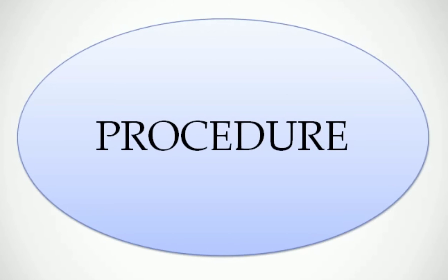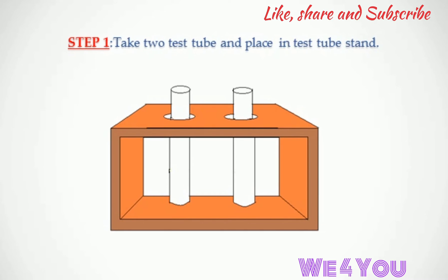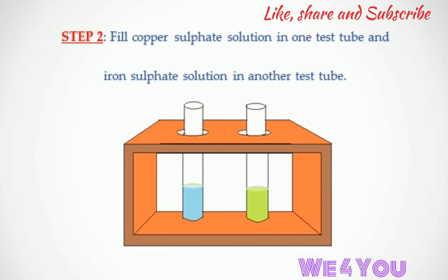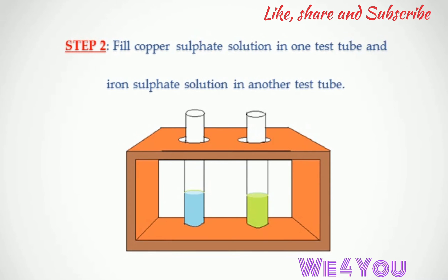Procedure. Step 1: Take two test tubes and place them in the test tube stand. Step 2: Fill copper sulfate solution in one test tube and iron sulfate solution in another. Copper sulfate solution is blue in color and iron sulfate solution is light green in color.